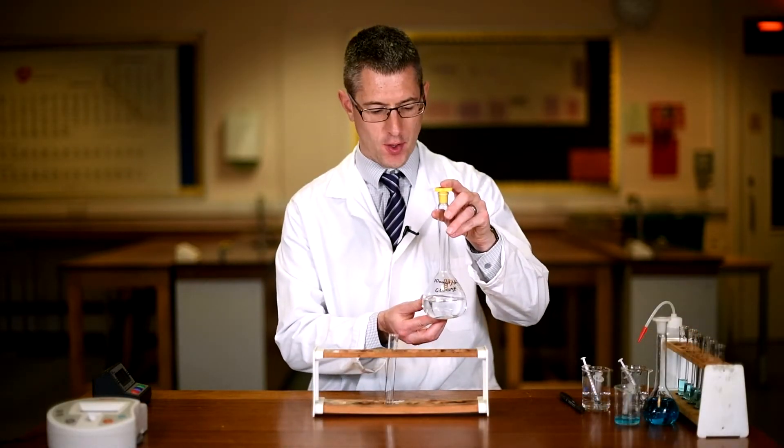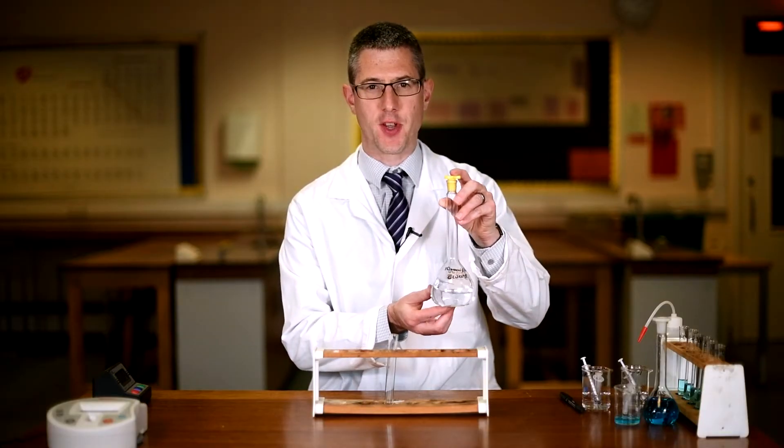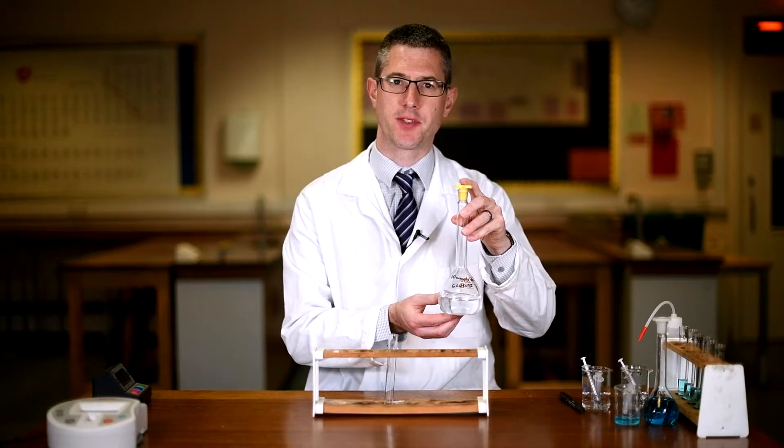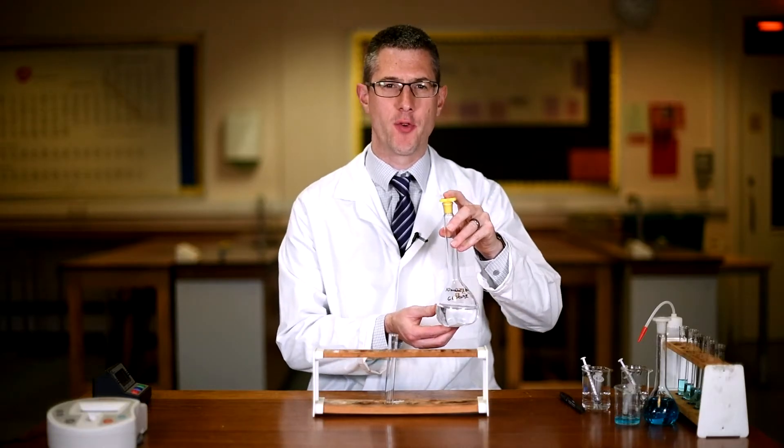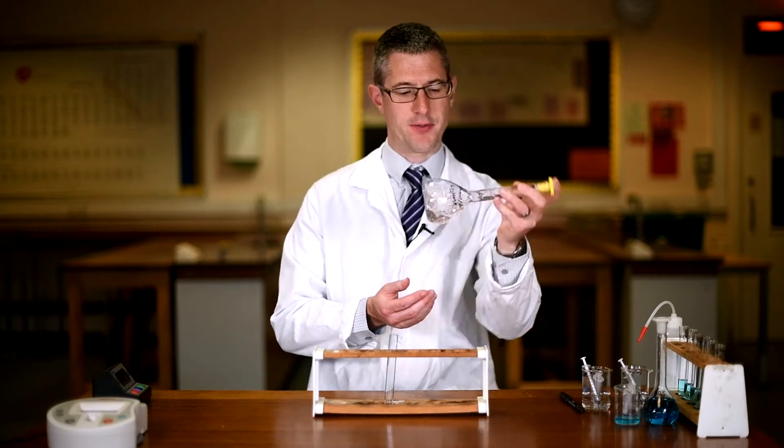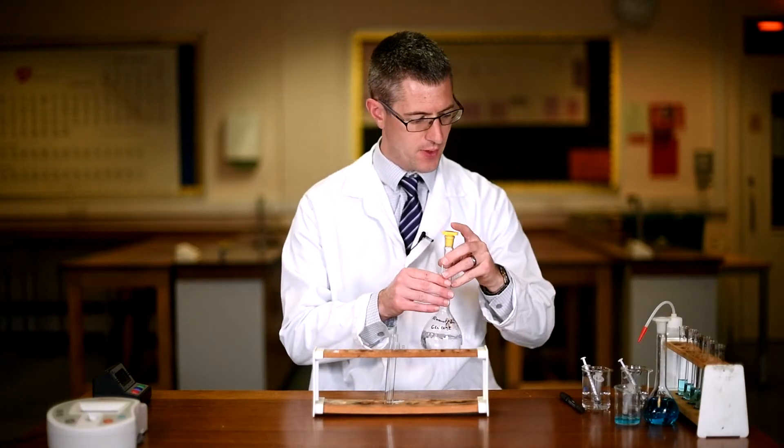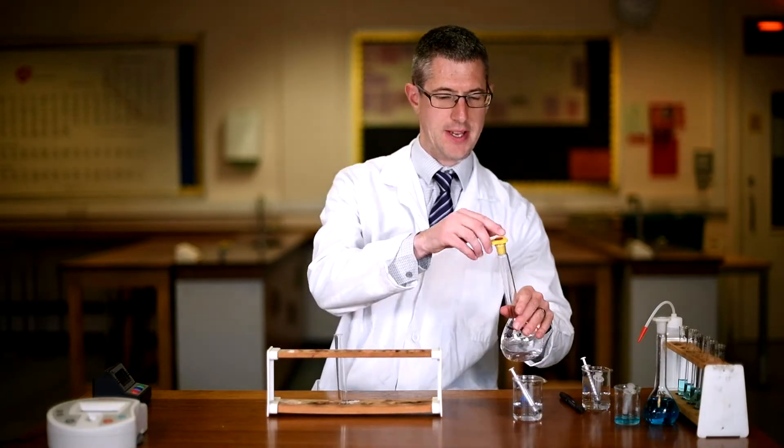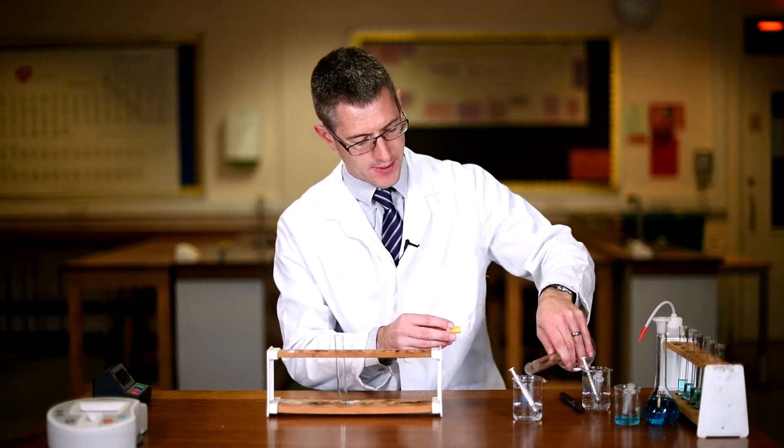So we have our stock solution of 10 millimoles per decimeter cubed of glucose. We need to make a dilution series of this to produce six test tubes, each of a known concentration of glucose. So give it a good shake, make sure it is fully suspended. We'll decant some glucose into a beaker so it's easier to use a syringe to get the glucose.